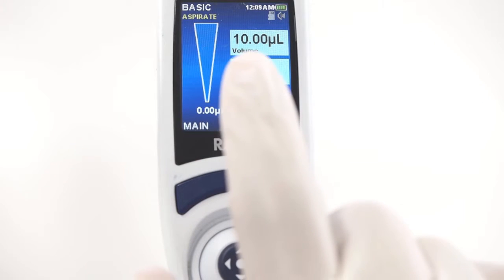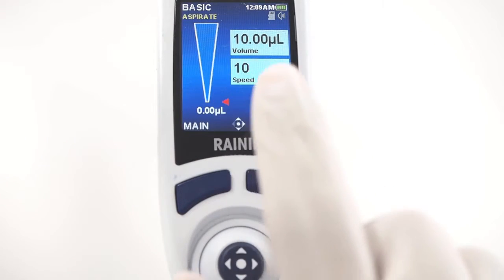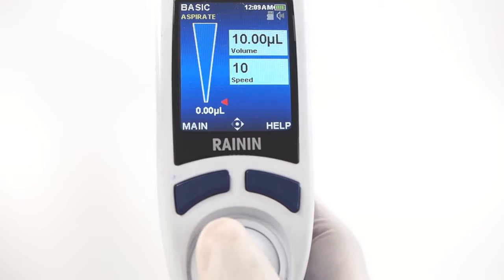Settings are on the right. In basic mode, settings include volume and speed. To navigate settings and options and to operate the pipette, use the joystick.